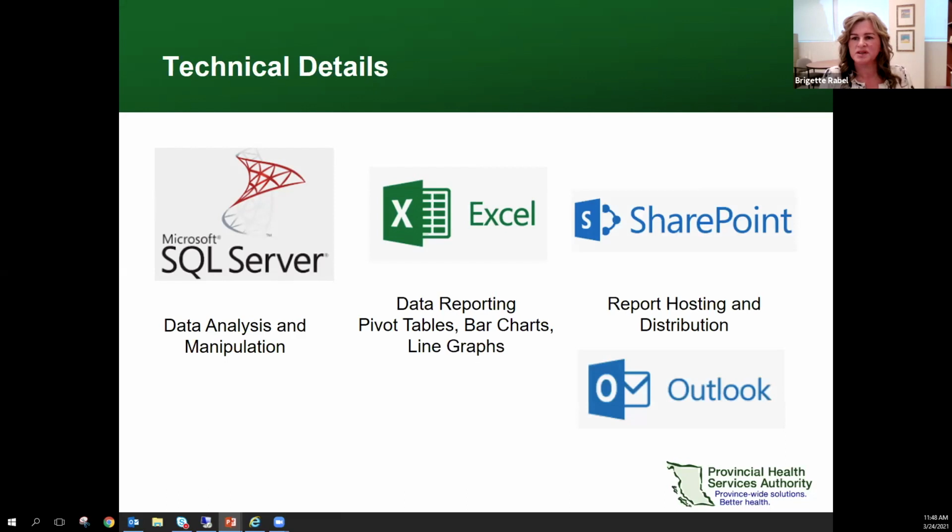We chose SharePoint to host the reports and Outlook to distribute the dashboard. So the benefits of SharePoint are that pathologists can access the dashboard whenever it's convenient for them. Like SQL and Excel, SharePoint is standard software across all health authorities. Access to SharePoint is easily maintained by me, and it is tied to user login, so no additional usernames and passwords are required. And access to SharePoint is internal only. It can't be accessed from outside the healthcare network.